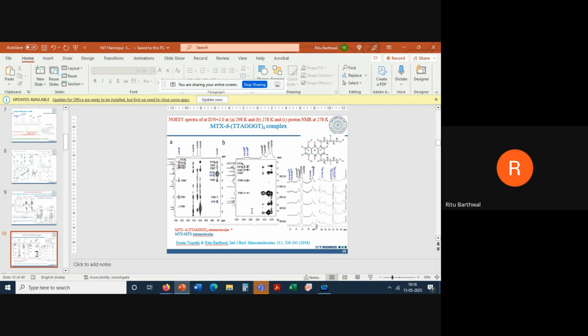So this is again the same, and you can see here very clearly. See, this is a small peak. This is a bigger peak. This is an intense peak. These are big peaks, and these are very small peaks here. Small peak means the proton which is in this line, this happens to be some guanine NH, is far off from this proton. So this is T7H1, for example, a sugar proton, and this is at a high distance to this one.